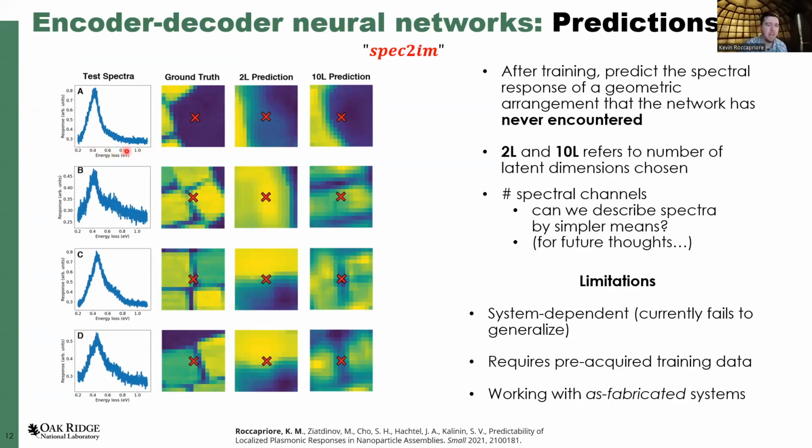So do we really need that? After subtraction and fitting the background, we're still left with something close to 2,000. But do we need that many pixels, or spectral channels, is what I'm saying here? Probably not, especially if the newer detectors have a lot less noise. Really, there aren't that many features in the spectrum here, and so we can probably get away with a lot fewer. This will help for training and so on.